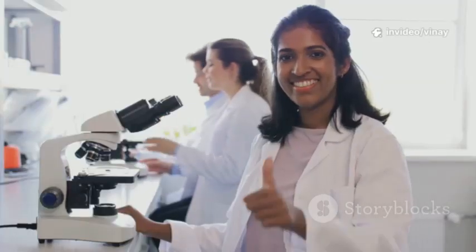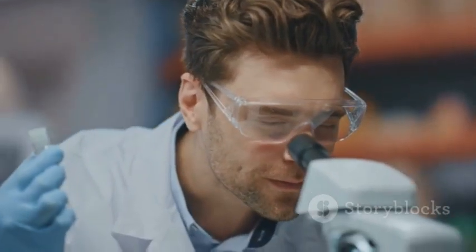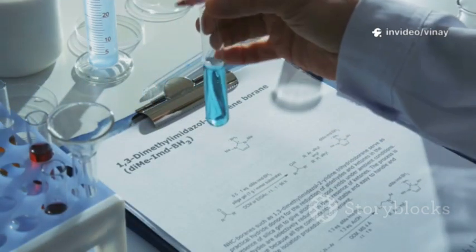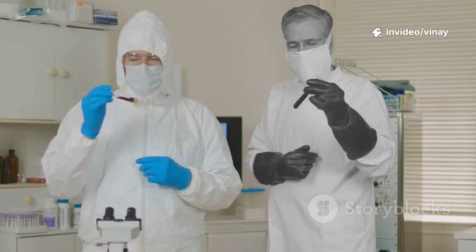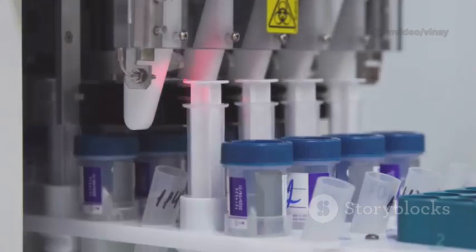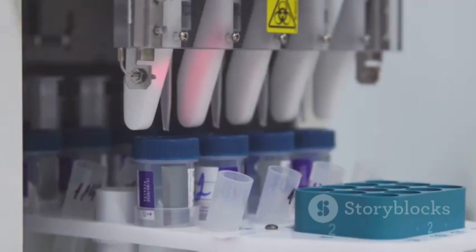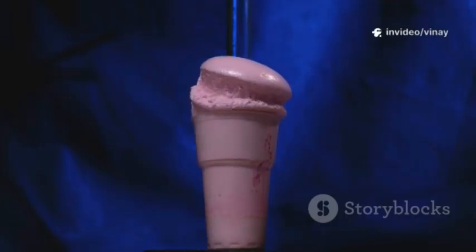It's the final confirmation that our filtration process worked exactly as planned and that the medicine we are about to give someone is as clean and safe as science can possibly make it. This guide is all about exploring these amazing tests. We're going to break down how they work in a way that's easy to understand. We'll look at the different types of tests, what they measure, and what the results tell us. You'll see that it's all based on some really neat principles of physics and chemistry.